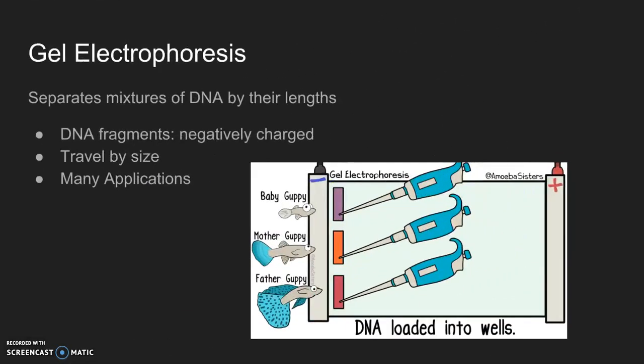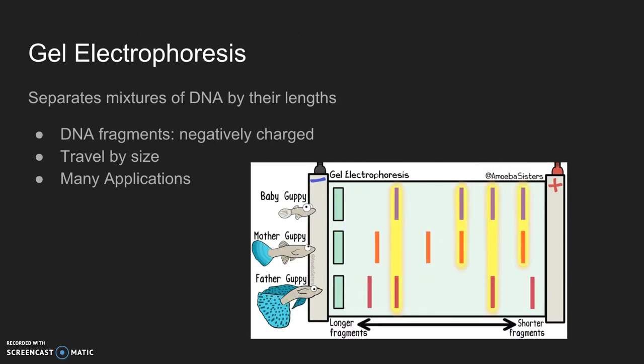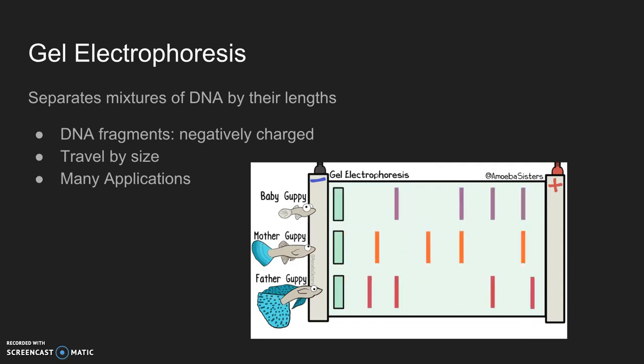Now that we know how PCR, or polymerase chain reaction, functions, we can explore some of its many applications. One of the most significant applications of PCR involves the use of the gel electrophoresis apparatus. With so much DNA rapidly produced, PCR has allowed researchers to use gel electrophoresis more commonly as well. This chamber is able to separate various mixtures of deoxyribonucleic acid, or DNA, based upon the segments' different lengths by loading a gel with DNA and running an electrical current through the gel.